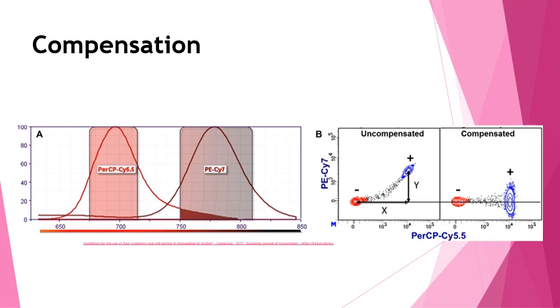Essentially you take that whole antibody batch that you made and you create wells per antibody batch. Those are going to be one antibody batch per well, for each one of your antibodies. So what this does is it allows the cytometer to read just that fluorochrome in that well.